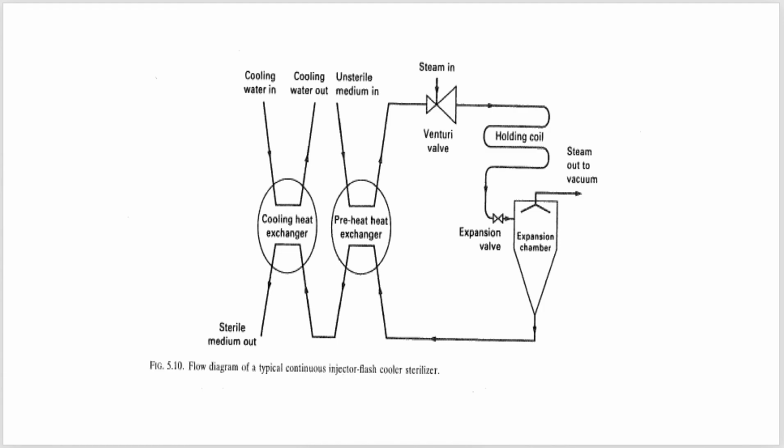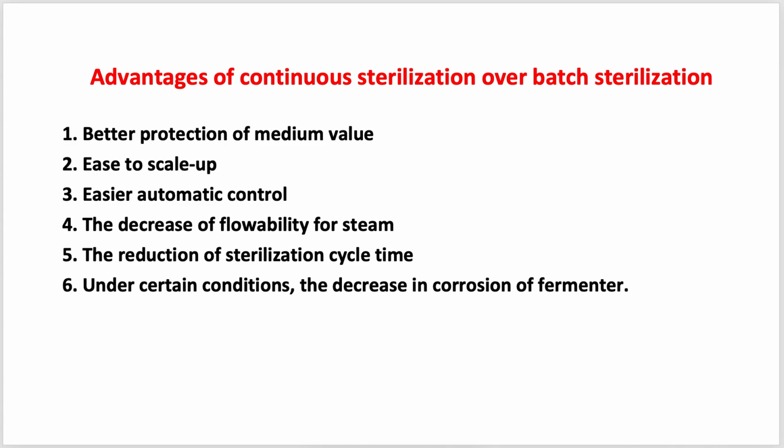So that was all about the continuous heat sterilizers. In the next part we'll talk about some advantages of continuous sterilizer over batch sterilizer. Thank you for your patience.